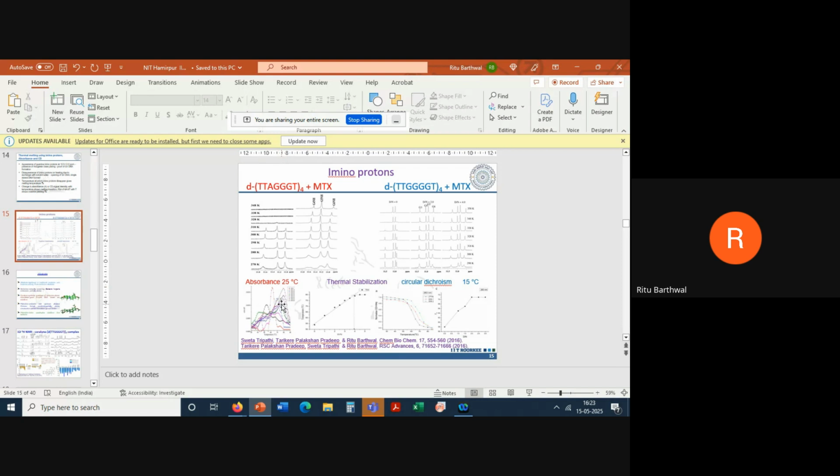This is an OD curve, only thing is we have plotted dA/dT. A is absorbance, and so it has given us a peak. And this is CD. CD of quadruplex is different from CD of single strand, so melting has taken place. This is the CD value along the y-axis and the x-axis is temperature. So we have done heating.